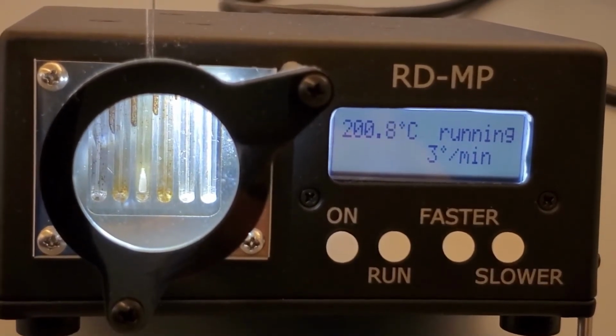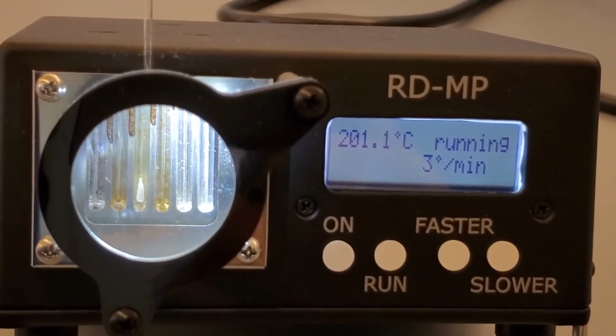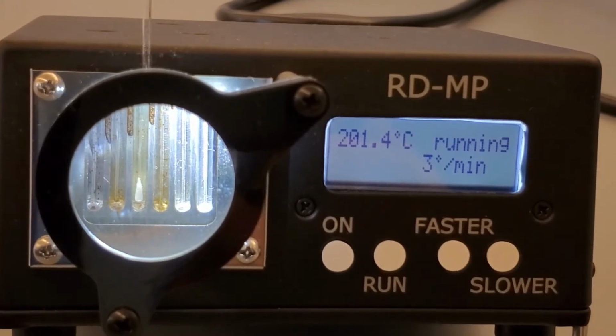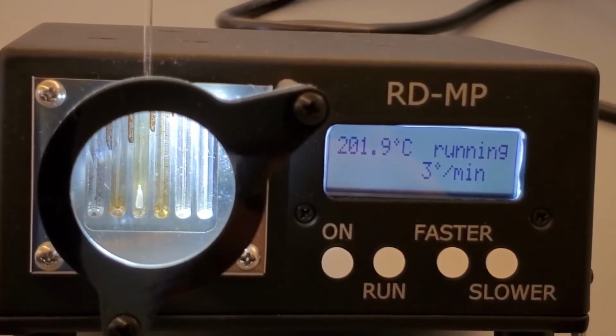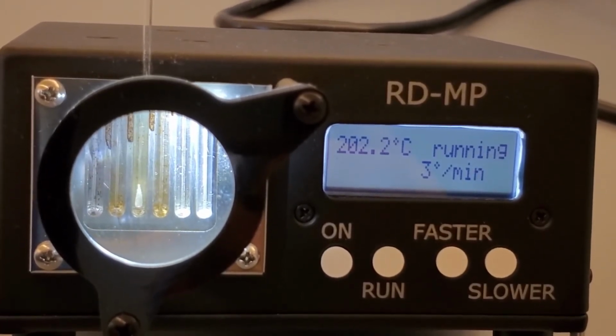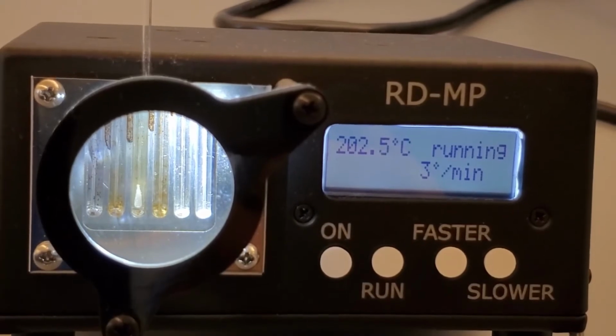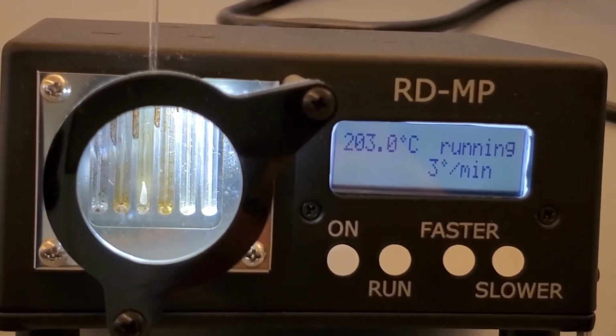As you can see, the product in the capillary tube is shrinking as the temperature is increasing, but we are not seeing melting occur. Unfortunately, the product is going through the sublimation phase change at a temperature lower than the melting point. We continue to ramp the temperature to see if we will get any melting before the product completely sublimes.